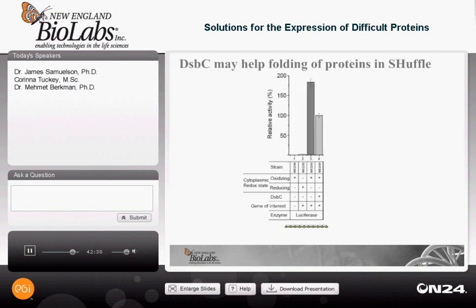We then had the hypothesis, as we said, that DsbC should increase the fidelity, but the disulfide bond forming machinery in the cytoplasm is much different than in the periplasm, so we wanted to test that idea. What we did is we took three proteins and expressed them in the cytoplasm of oxidizing cells that either have DsbC or not. The dark bar represents cells that do not have DsbC, and the light gray bar represents cells that do.